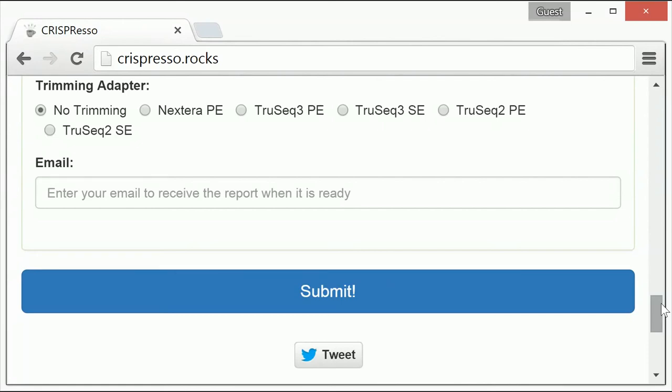However, if the adapters have not been trimmed, then select the adapters used in the experiment and CRISPResso will trim the adapter sequences for you.